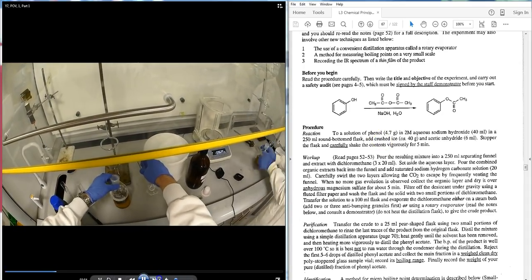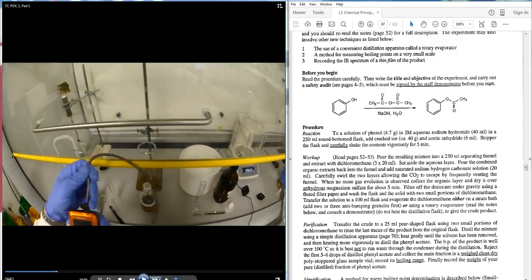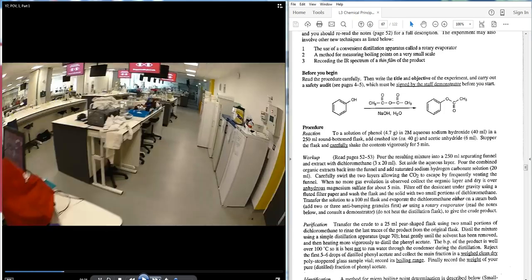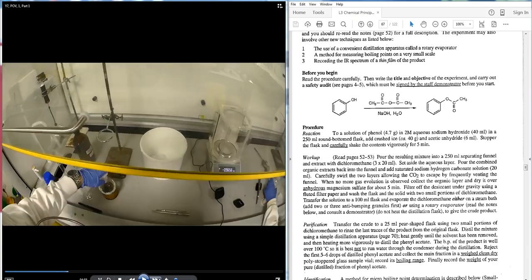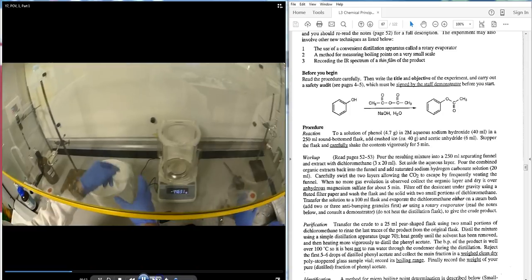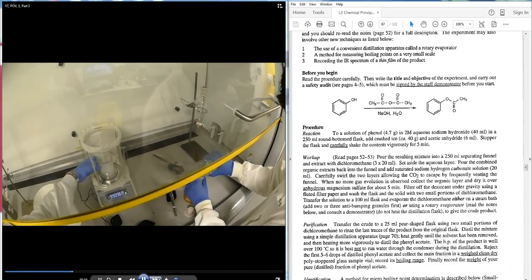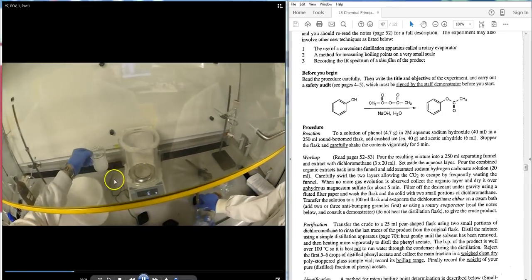A quantity of crushed ice is then added, from a beaker or dish that is to be weighed out. The student takes some ice from the beaker beforehand, and it is recommended to dry the beaker as well. If the balance doesn't have enough decimal places, move to an alternative balance.